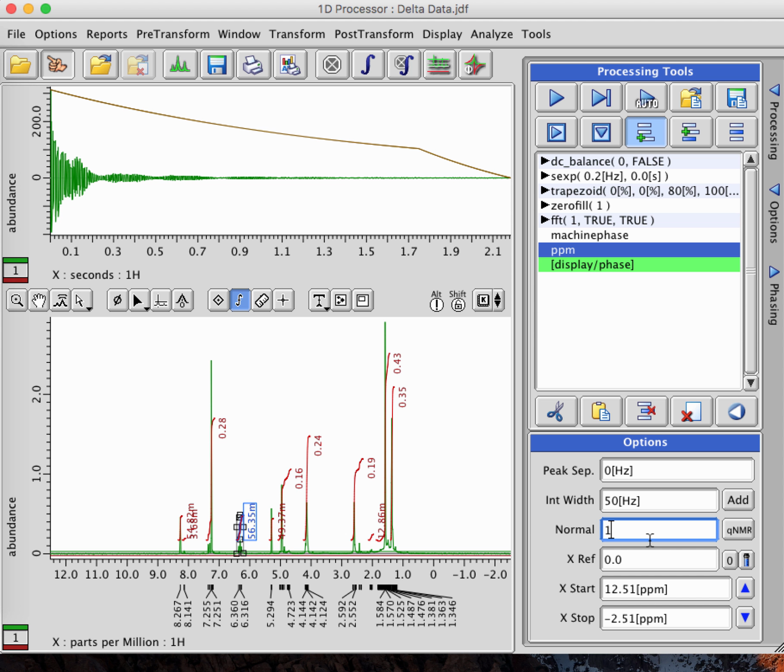It was reading 56.35 M, who knows what that means. Now if I hit this, it goes to 1, and it normalized everything else into values that we might be able to determine: 1, 5, about 3, about 4, about 3. It makes it a lot easier to actually interpret our spectra. Okay, that is your first lesson.